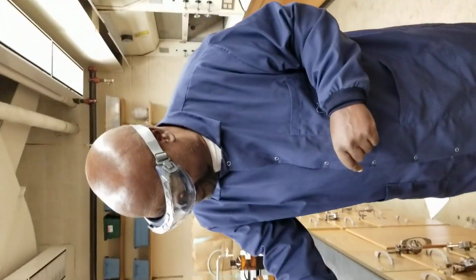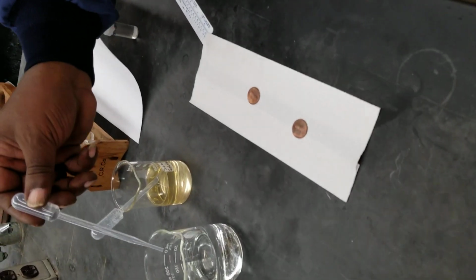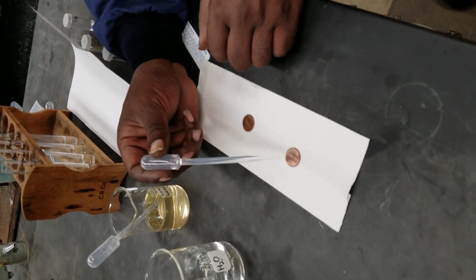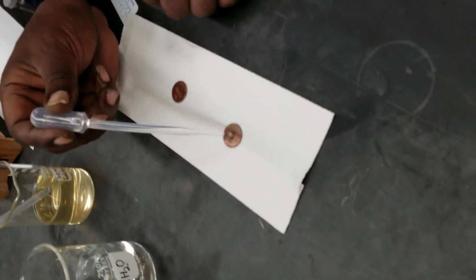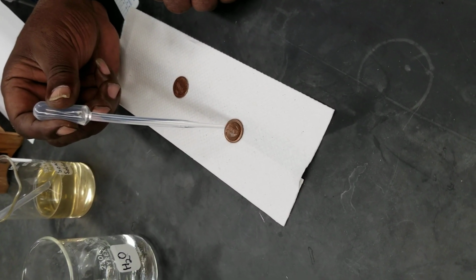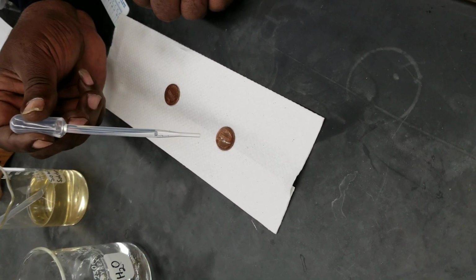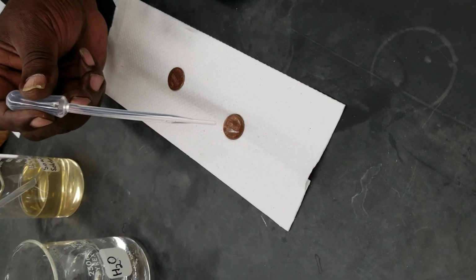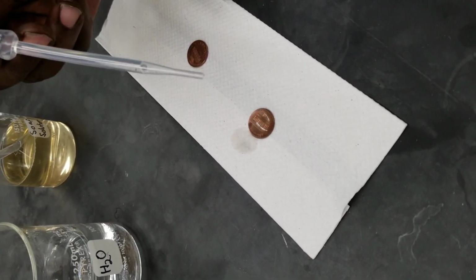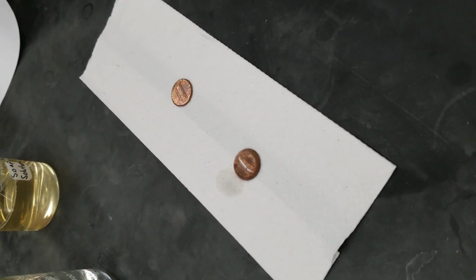So let's try this. Good old H2O. Count the number of drops it takes. I've never done this before, actually. 1, 2, 3, 4, 5, 6, 7, 8, 9, 10, 11, 12, 13, 14, 15, 16, 17, 18. 19. Do I have overflow? No. 19, 20. Now I do have overflow. You could see the nice shape, round.